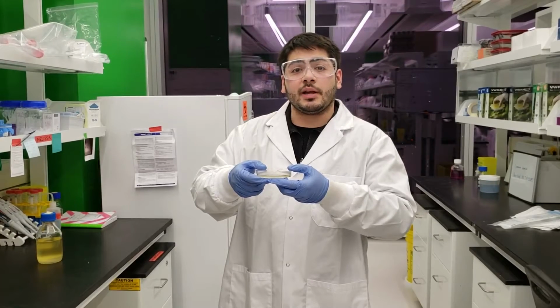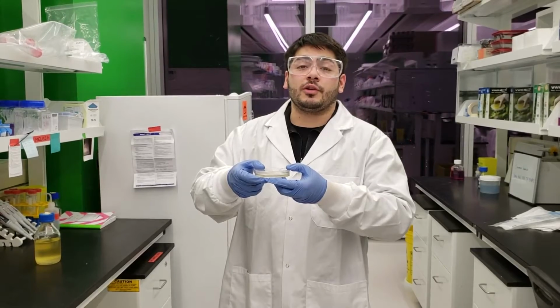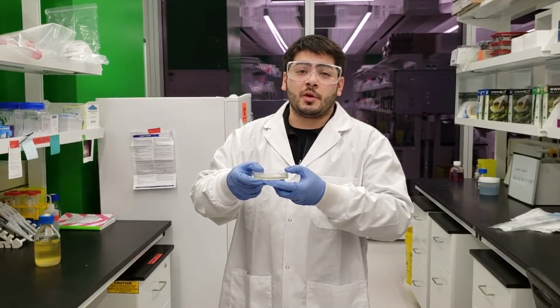Now you're going to let them sit and cool at room temperature, and if you're not going to use them right away, it's best to store them in the fridge at 4 degrees Celsius. You can pour as many plates as your experiment calls for.